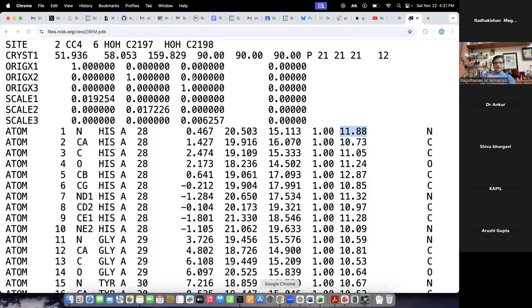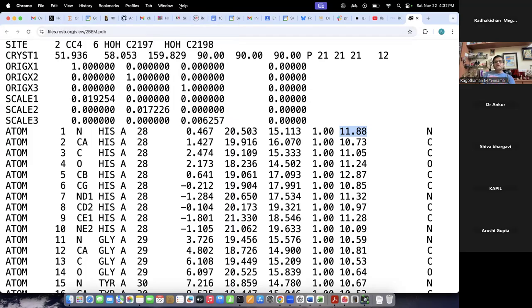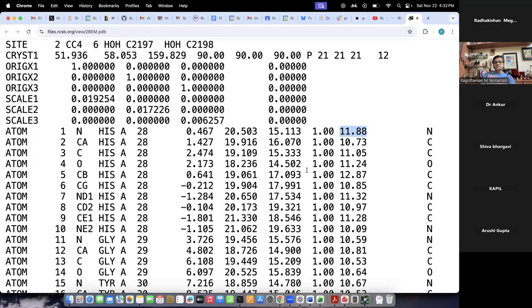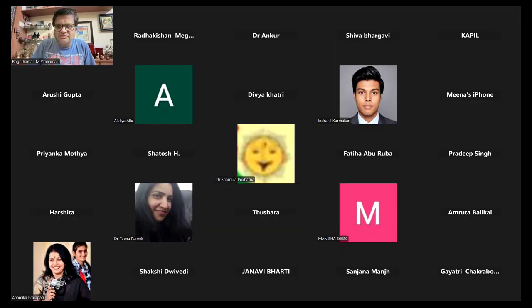I am going to show you about... Yes. Wait, I had it. Let me just look at the browser that I had set up for Haddock.